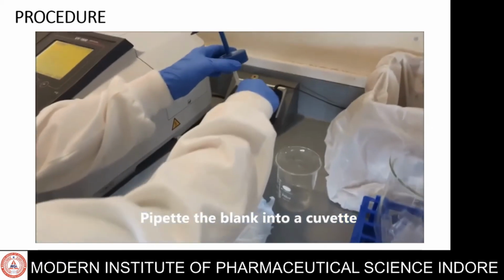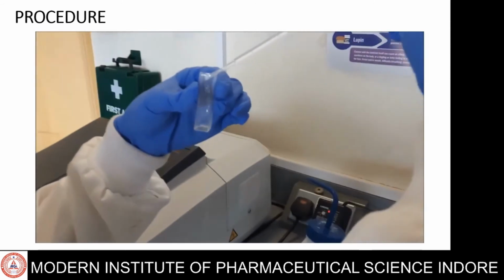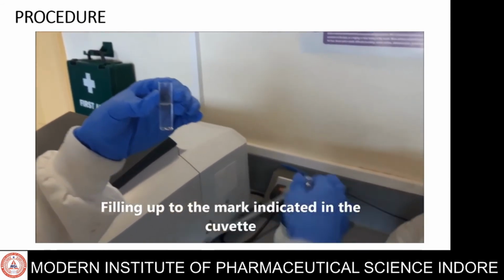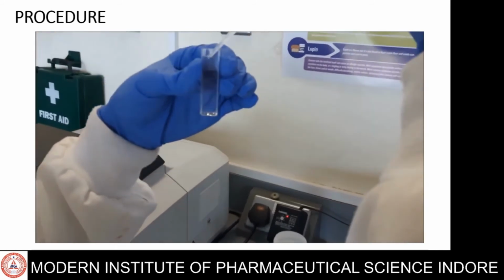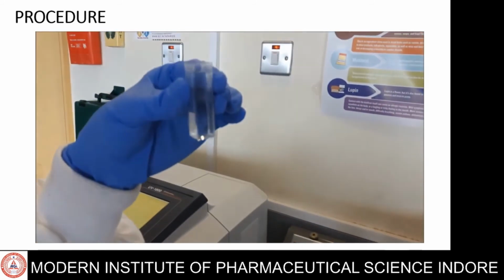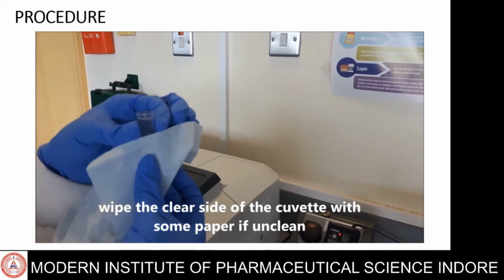Pipette the blank into a cuvette. These are the cuvettes which are used for analyzing the spectrum in the UV visible spectrophotometer. Fill up to the mark indicated in the cuvette with the help of a micropipette like this. Wipe the clear side of the cuvette with some paper if unclean.